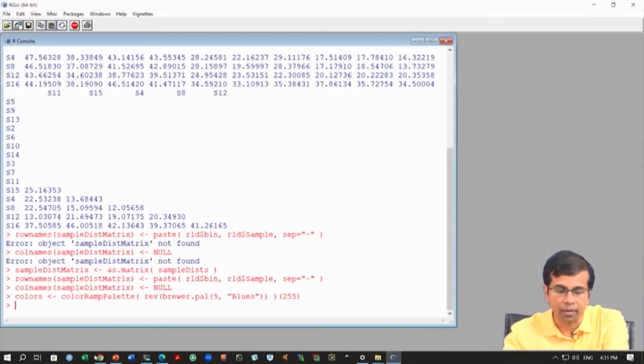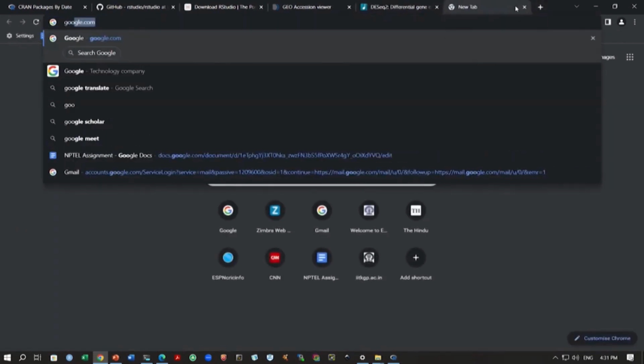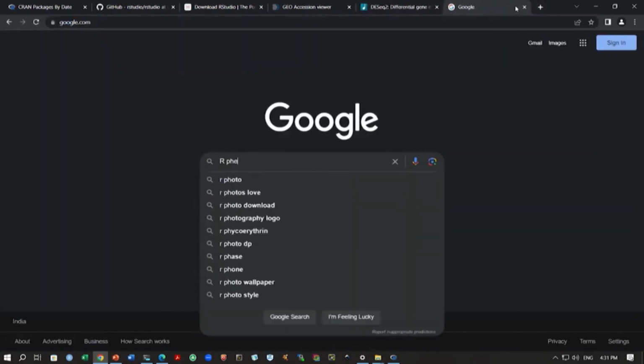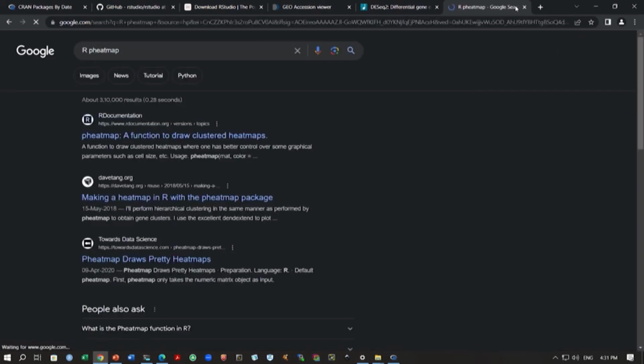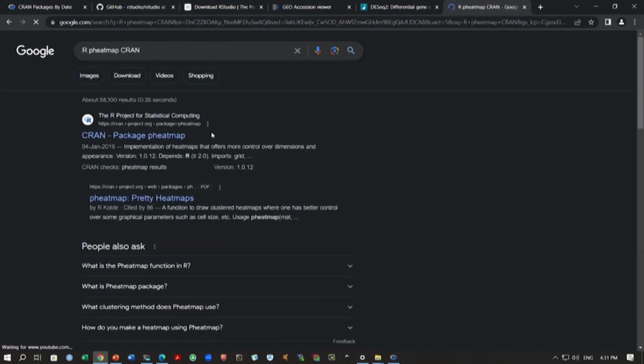So, I can go back and show you our pheatmap. So, pheatmap in CRAN, you will have this manual.